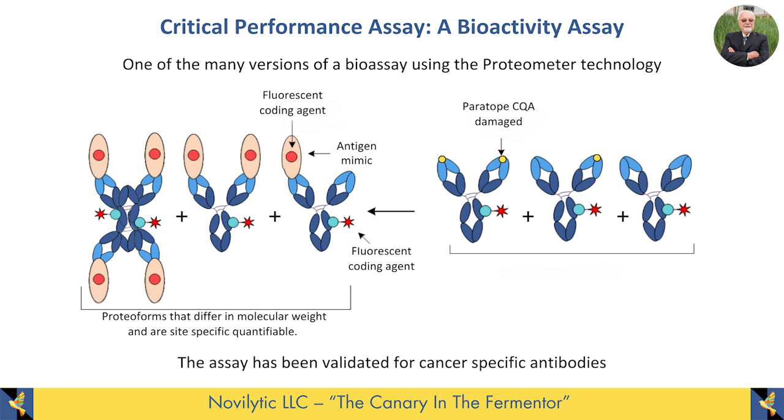And I'll take a case that you can have. An antibody has 2 active regions that bind to other molecules and that you would use for a biological function. And so the paratopes would be here, the part that binds to some other molecule. The little yellow dot up here says that this antibody has 2 identical parts, but there's one part that's defective.